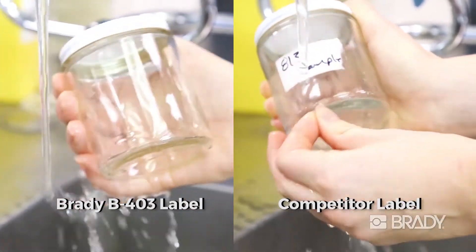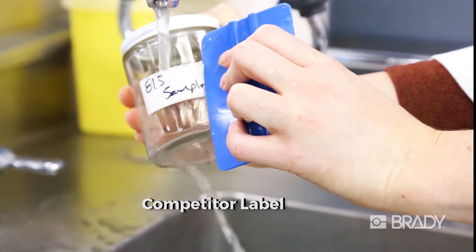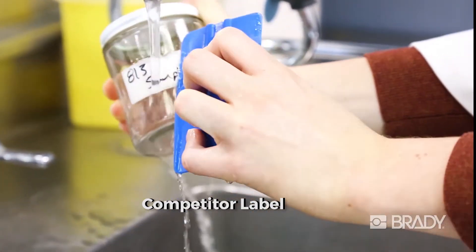As you can see, there is no trace of the B403 label. This eliminates labor required for label removal and allows for easy re-identification.